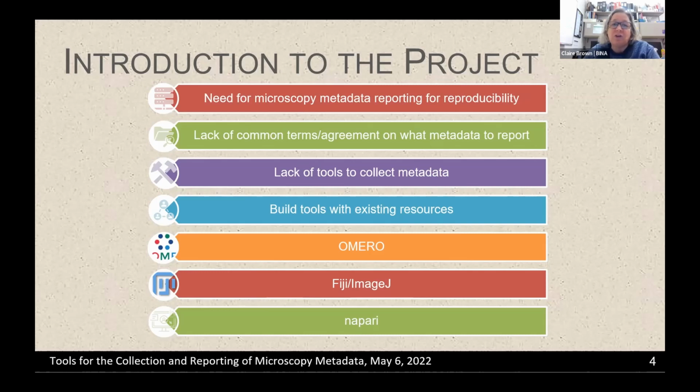So the workshop today is really presenting 2 tools that our team have developed in order to collect the metadata and do a first pass at the methods section for publication. And the tools were really trying to build on existing resources. So MethodsJ2 builds on Fiji.